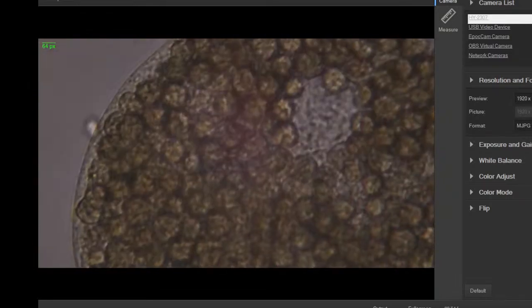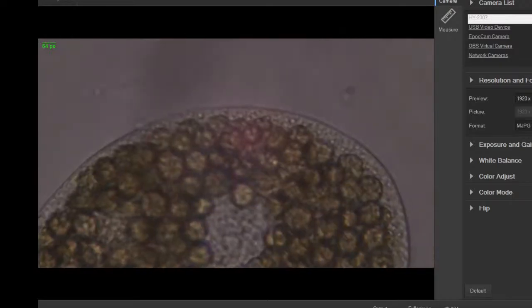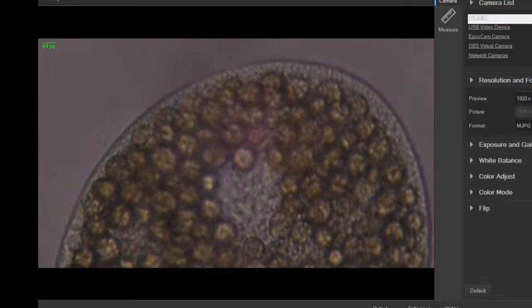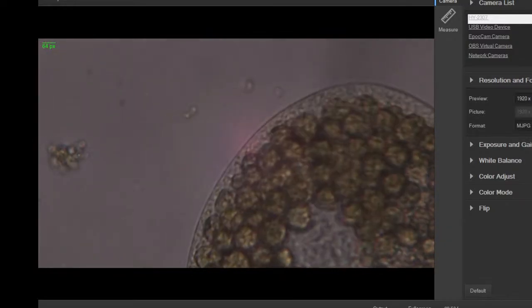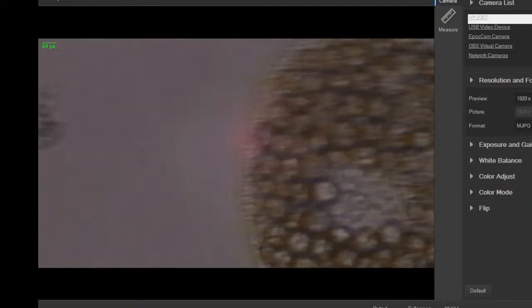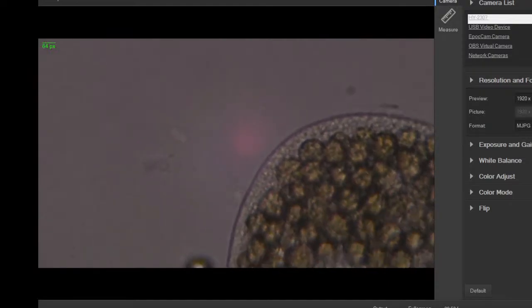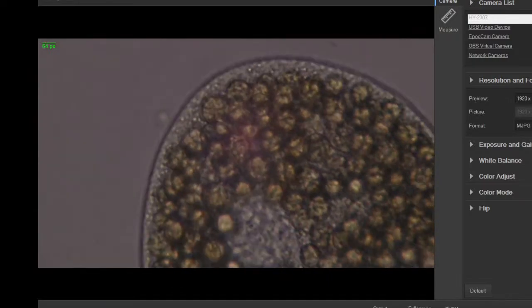So when you see those other videos I have where the cells are dying, the cell has just either from age or from something in the water it didn't like, or the heat of the lamp over time, it just stopped functioning properly. And as the cell dies, the cell will basically lyse or split open from water pressure, pop like a balloon, kind of, sort of.